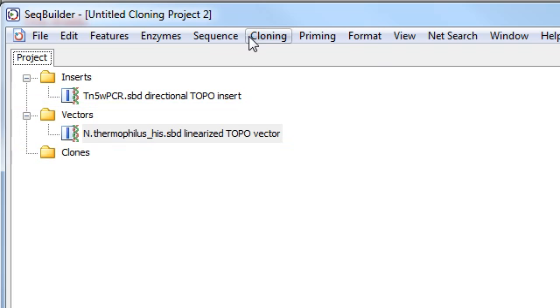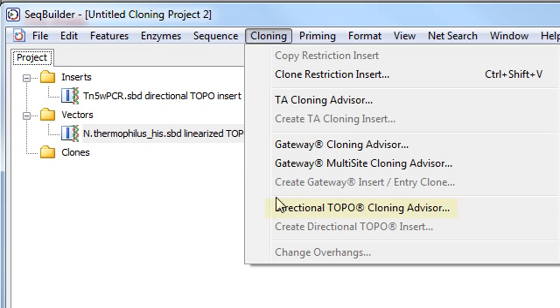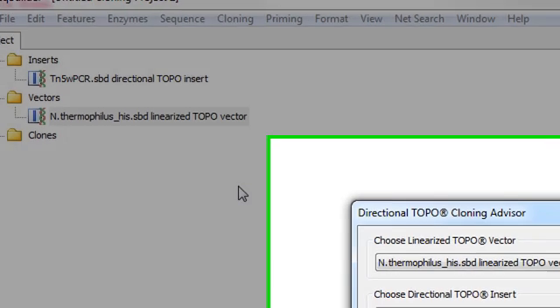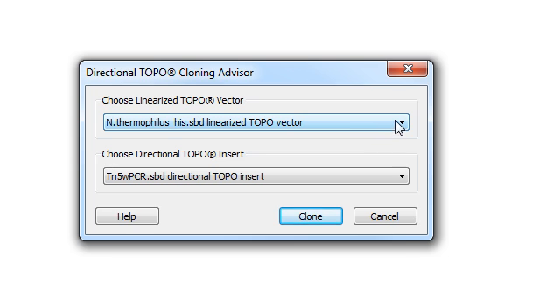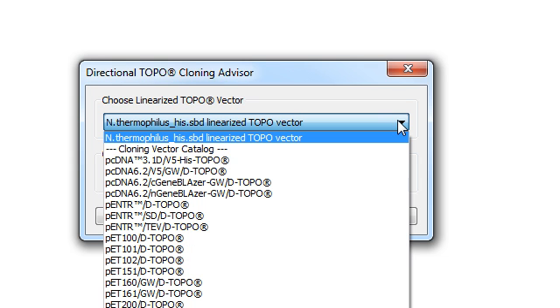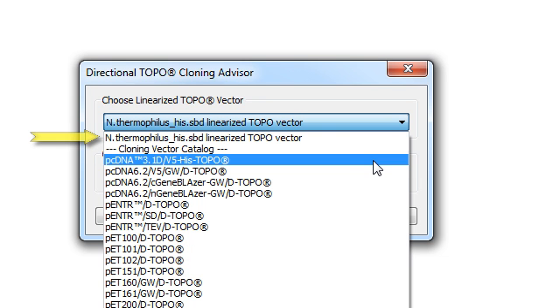And you can also see that when you open up the Directional TOPO Cloning Advisor, you can see it's already selected here for us, and it's listed above the vectors from the vector catalog.